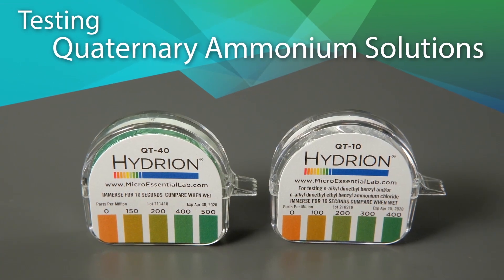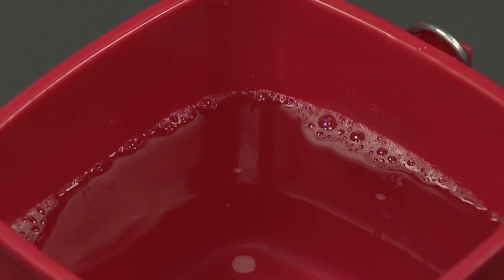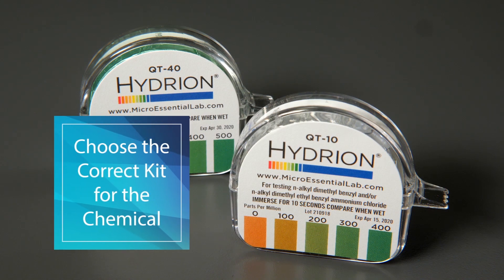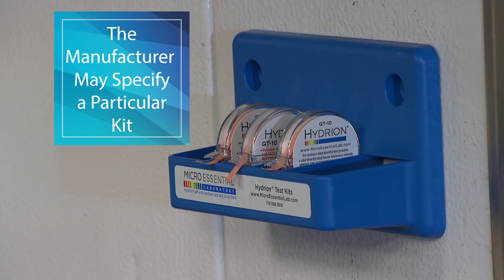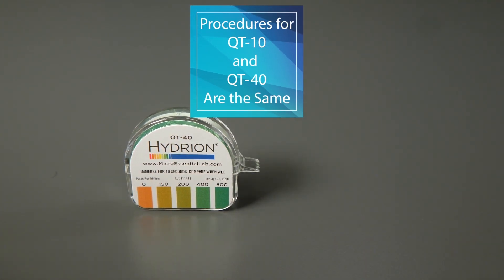Testing Quaternary Ammonium Solutions: Prepare the QUAT solution according to the manufacturer's instructions. When testing the accuracy of its dilution, be sure to choose the correct kit for the chemical in use. The sanitizer manufacturer may specify a particular kit. The test procedures for QT10 and QT40 kits are the same.